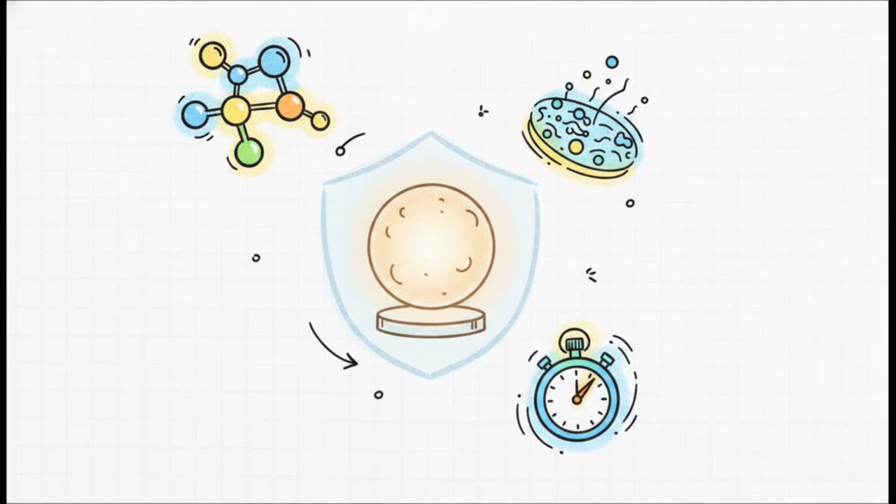So by reading that spectrum graph, researchers aren't just taking wild guesses. They get precise functional group identification and incredibly detailed chemical bonding data. It reveals exactly how different molecules are interacting with one another. And honestly, the best part? It does all of this extremely rapidly, and it's totally non-destructive. That means you don't have to destroy your precious, expensive nanoscale sample just to analyze it.